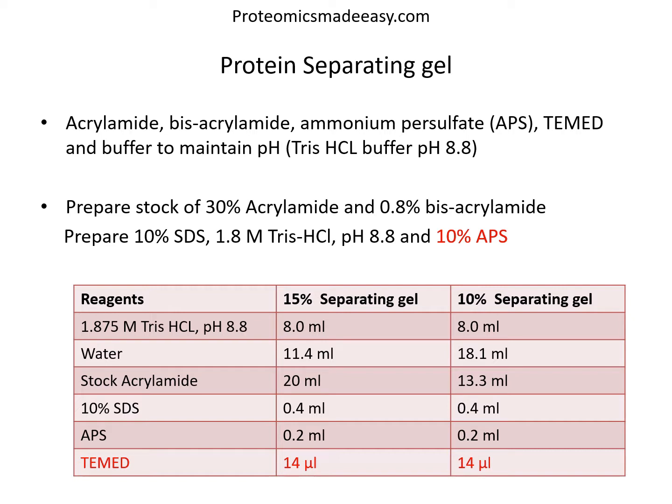To make sure that the gel sets with a smooth surface, I usually add around 200 microliters of distilled water on top of the gel. Because of the difference in density, water will spread across the surface of the gel without serious mixing. Some people add a water-immiscible organic solvent such as isobutanol to the top of the gel. Once that is done, now you can let the gel set.